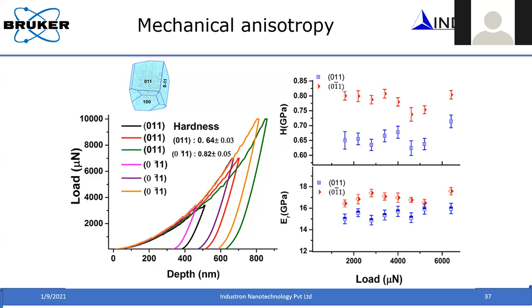I mentioned that you don't have to just do nanoindentation. You can do particle compression. In that case, your tip is much bigger than your particle. It has to be, otherwise you can't compress. That is what you probably saw. You have a bigger tip and a particle, and you want to compress the particle. That test is basically a compression of the particle rather than indentation.